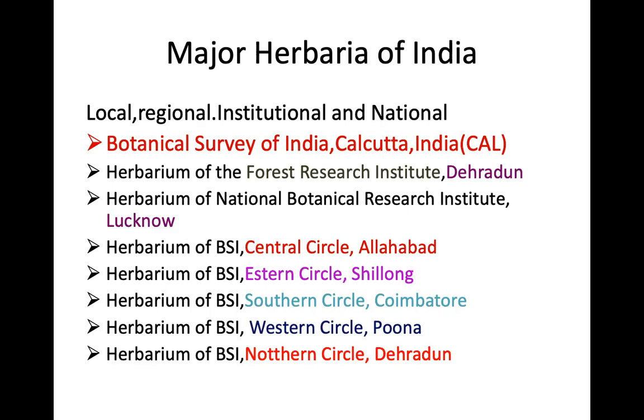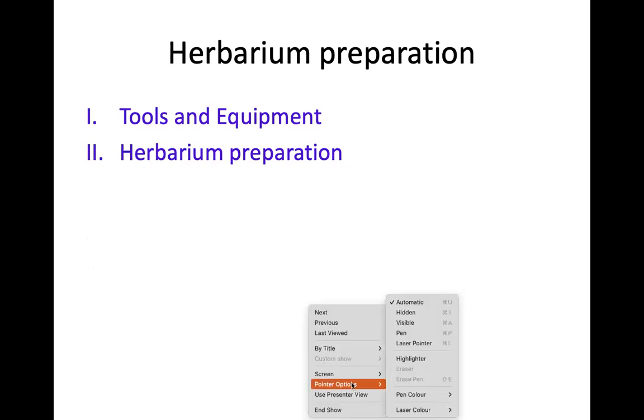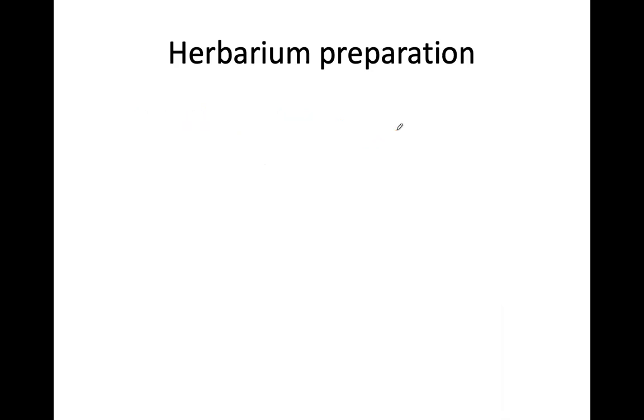Then we talk about herbarium preparation. The preparation and preservation of herbarium specimens involve the following steps: tools and equipment, and then herbarium preparation. We will learn the steps of herbarium preparation.